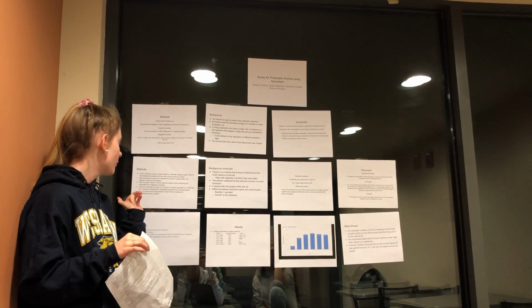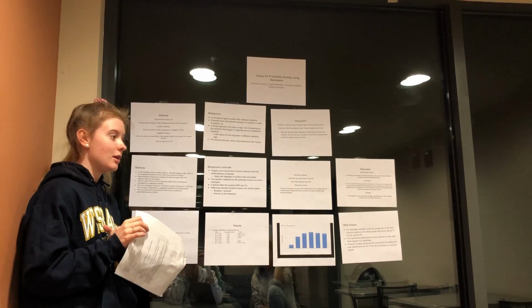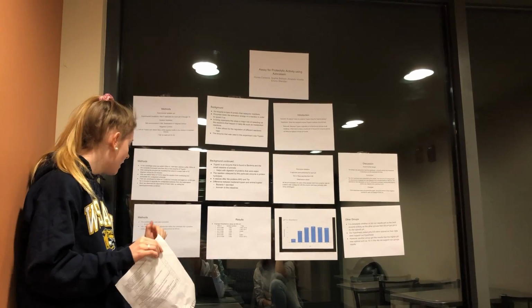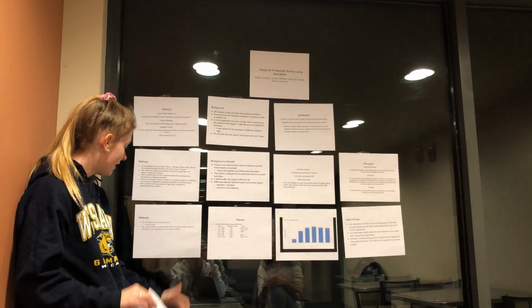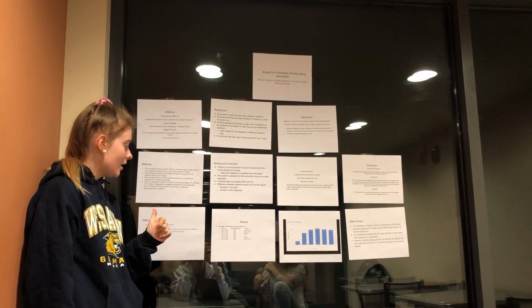Next, we observed the absorbance of each tube by setting the spectrophotometer at 440 nanometers. The substrate we used was azocasein, which is a milk protein, and the random addition of a sulfonamide within the substrate has a positive correlation to the absorbance measurement at 440 nanometers.